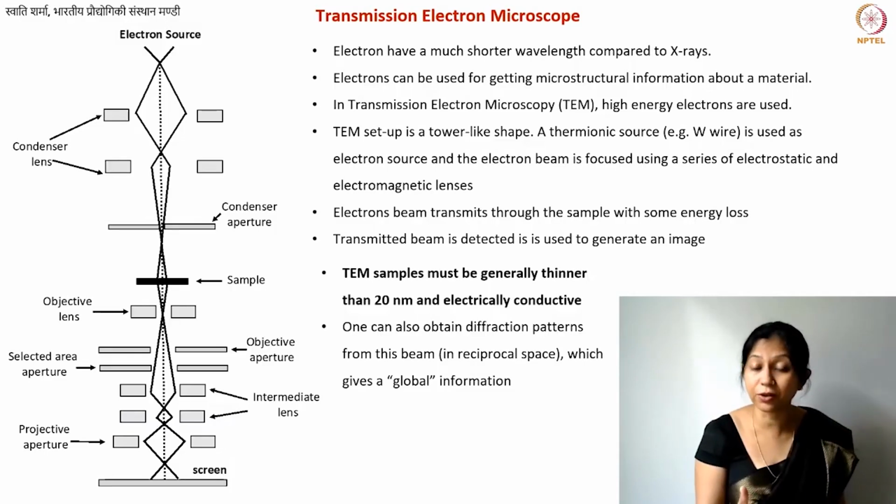So you also know that you might be inducing some stresses in your sample. Or if you're using any technique for making powders, in that case also you need to make really thin powder. So the sample preparation is not all that easy. Okay. Now, can you get only images from transmission electron microscopy?